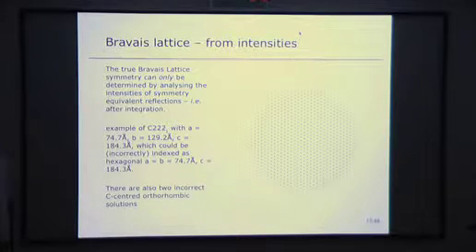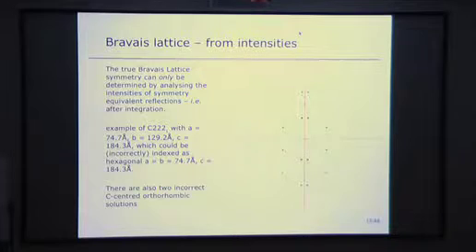And so you can only do that after you've done some measurement of intensities. And you can see that the apparent hexagonal symmetry I had in the first image disappears very quickly when you look at a zone. I think, is that the H0L zone? No, one of the major zones in the data. Yeah, sorry. And you can see quite plainly that there is a twofold symmetry there and twofold symmetry there, and there is no sixfold symmetry in the apparent hexagonal sixfold axis.